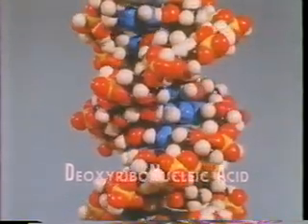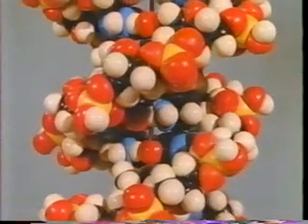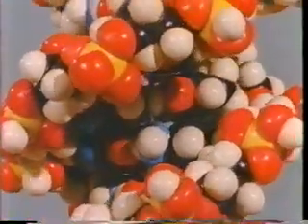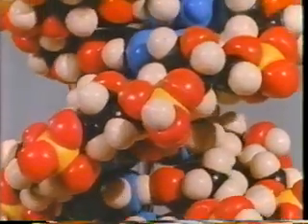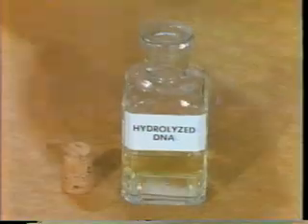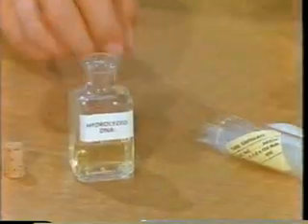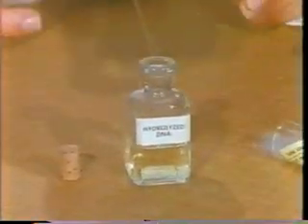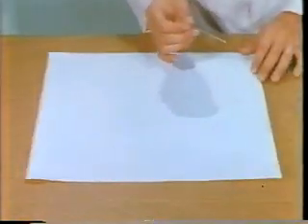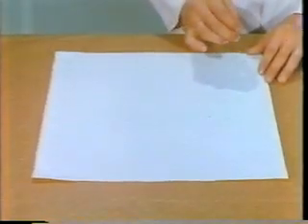Because DNA is a large, complex molecule, it is helpful to break it into its component parts and identify them. These component parts can be separated from each other by the technique of paper chromatography. After treatment with an acid, a small drop of the chromosomal material is placed on this large piece of filter paper.